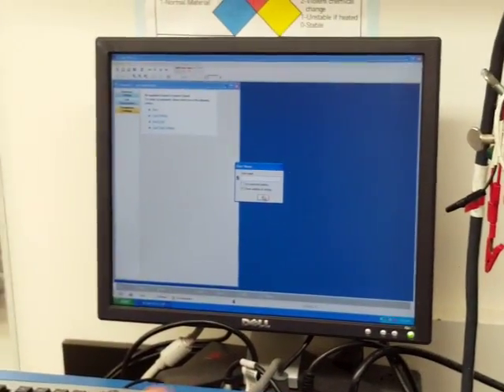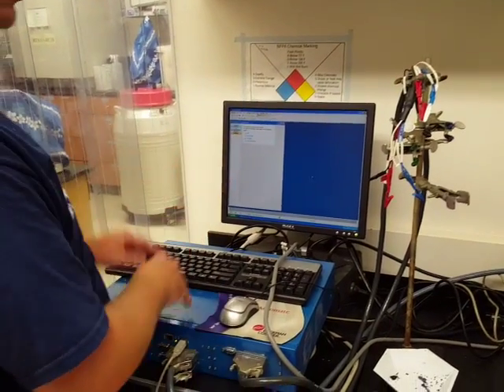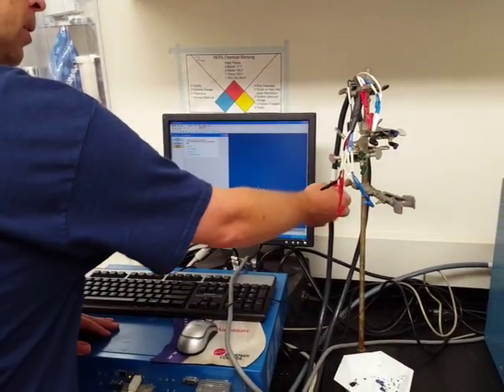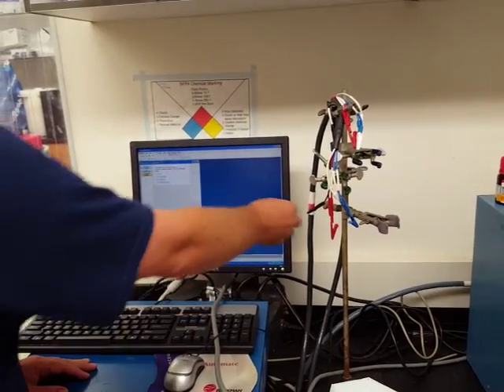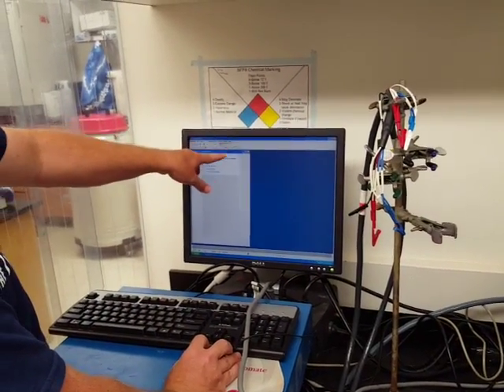All right. These two opening menus, you can just say okay or close out of them. We have to know which channel we're going to be working on. There's 3 channels, and it looks like this one is the one that we'll be setting up here. So we're on channel 3, okay? You can read on these wires here. So we can click onto the channel that we want. We click on channel 3 there.